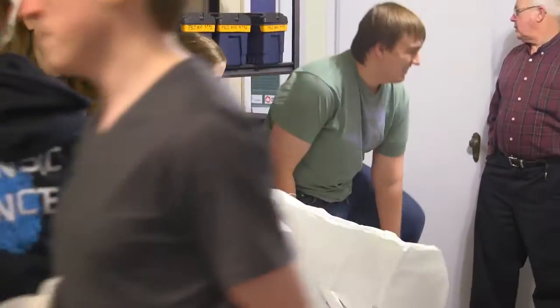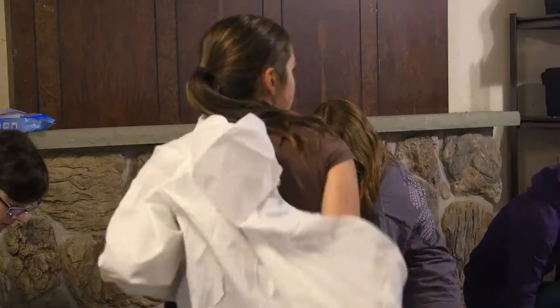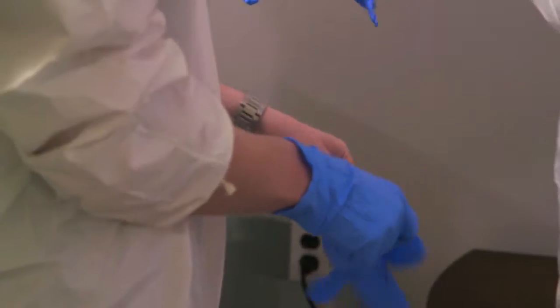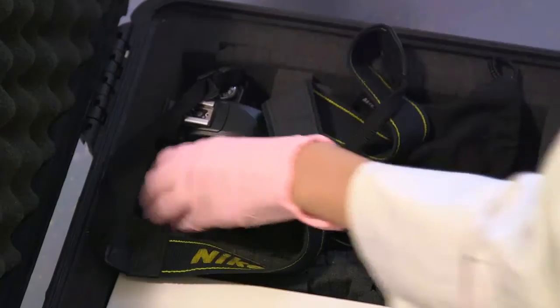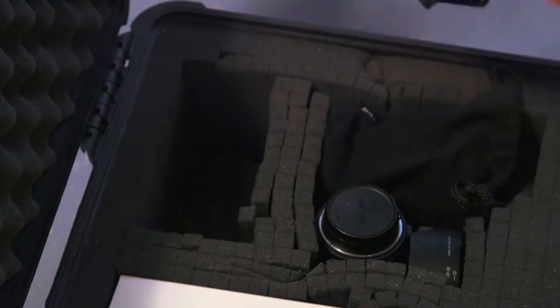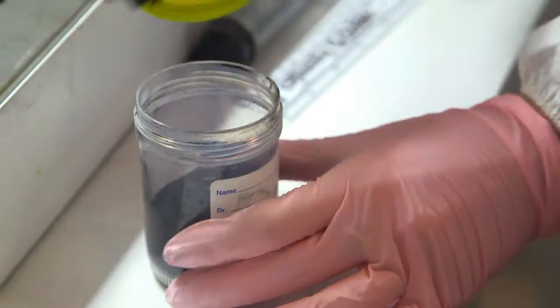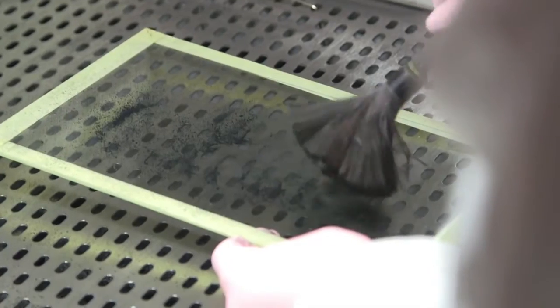Our storage, instrument room and team preparation area is located in the basement. Here students put on their personal protective equipment as well as assemble their team's digital photography and scene field kits. Specialized equipment for scene analysis such as fingerprint chambers are also housed here.